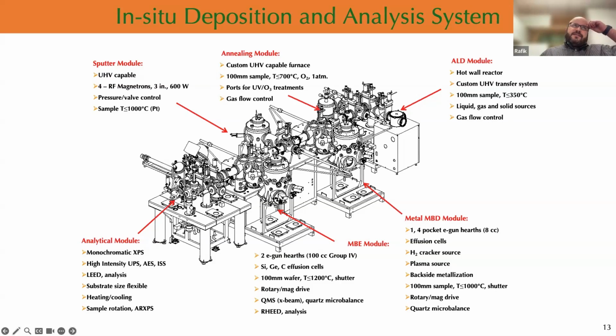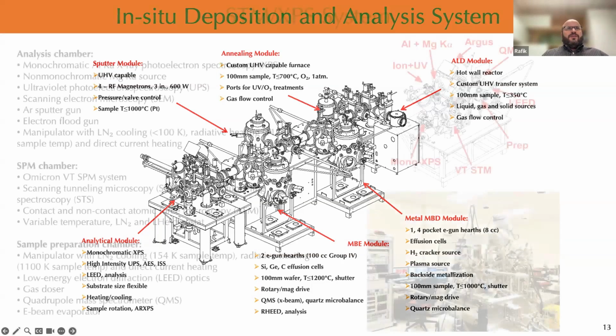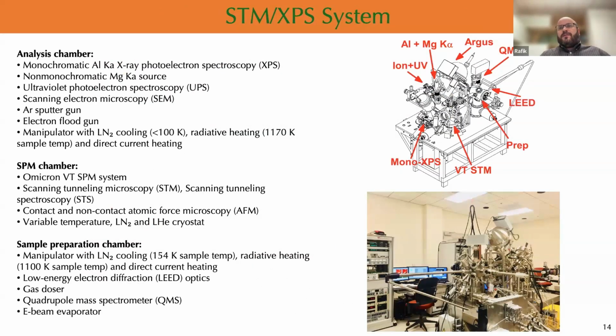This tool in the beginning had an STM here, as you can see. This is the wobble stick to take the sample from the XPS chamber. But since they moved this in 2013, I think, to the first floor, the STM never worked, because of the vibration. Now we have a LEED here. And I will show you next the other tool that I have that has an STM, which is like a miniature of the cluster tool.